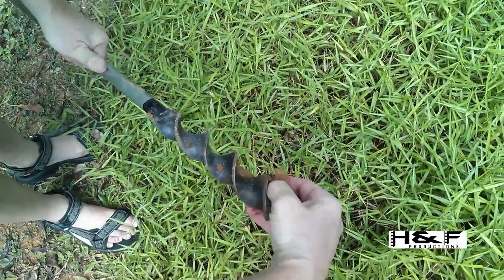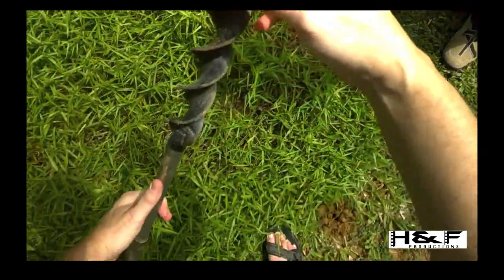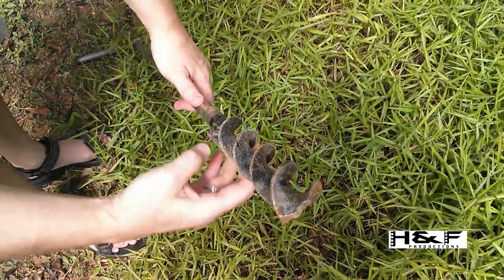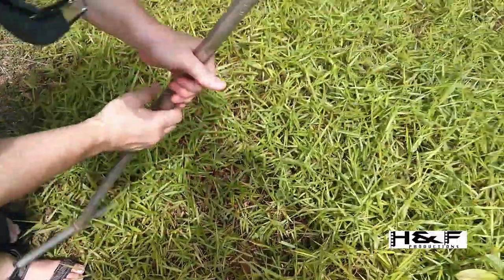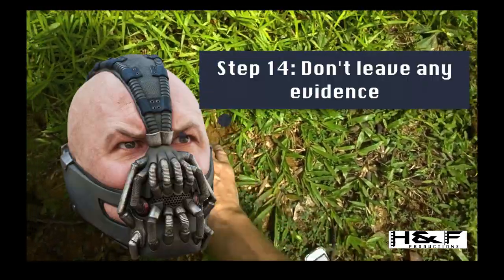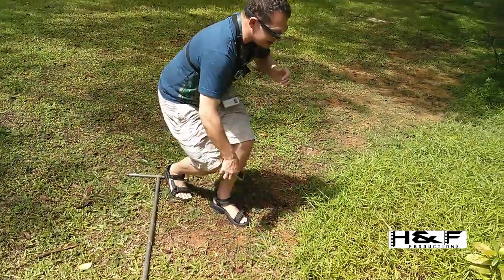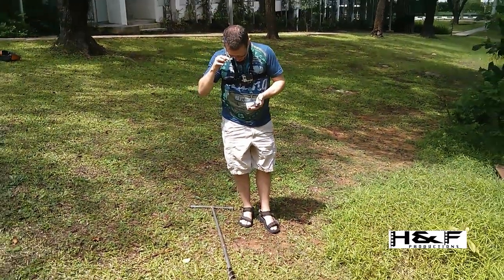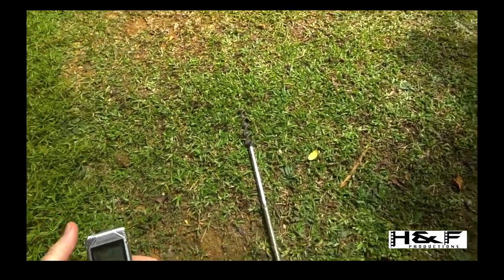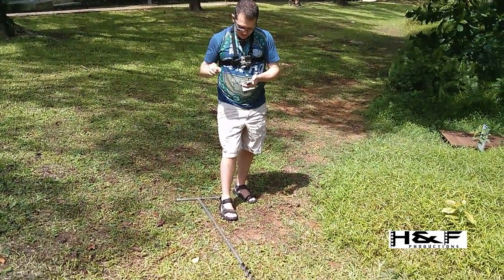When you finish using any equipment, including soil augers, clean off the soil. This is a fairly reasonable auger — the blades are not sharp, but nonetheless be aware that they are still blades. I'm going to place that down and cover the hole back up so our sampling site is mostly as we found it. For safety's sake: arrive at the site with the auger broken down, assemble the auger at the site, take the sample, and then break the auger down again before you leave for transport away from the site.